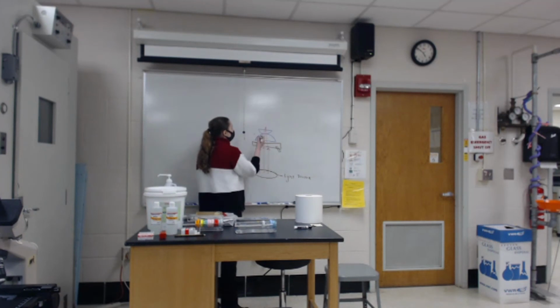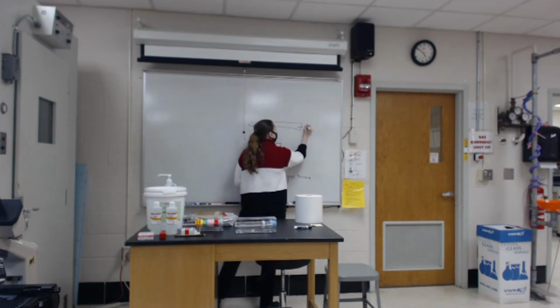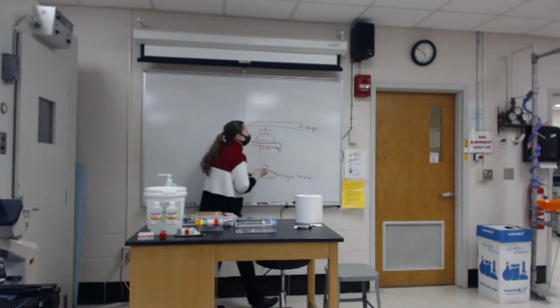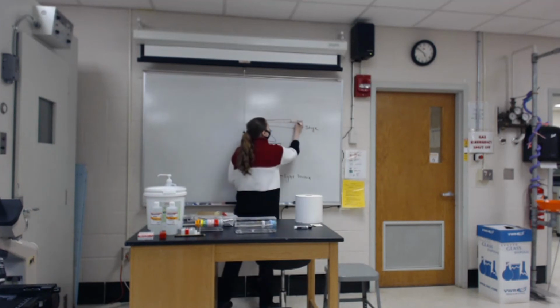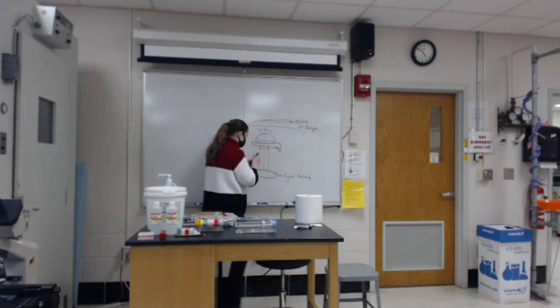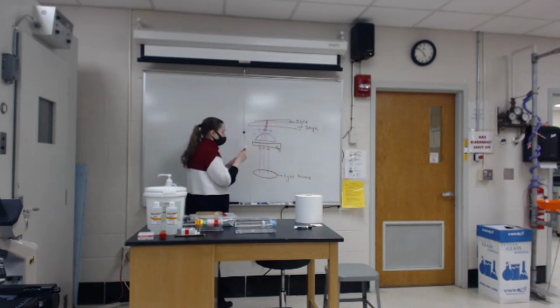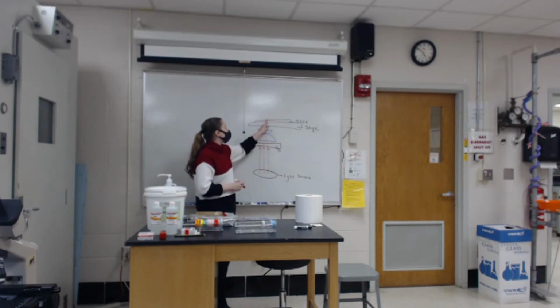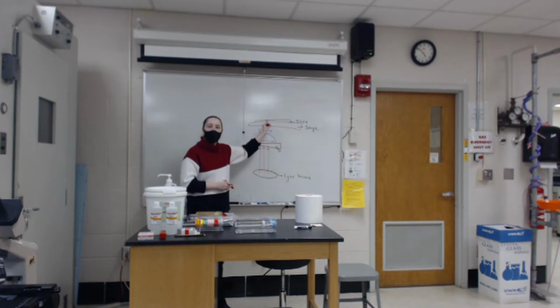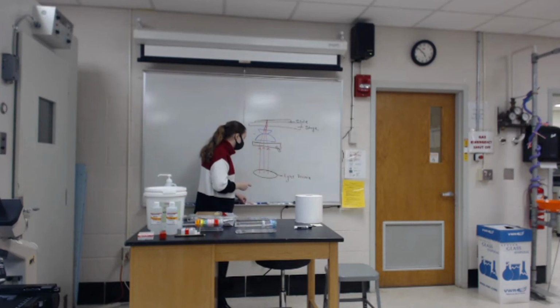Past the condenser, we're going to have the stage. This is a mechanical stage, and the stage is where we're going to rest our sample. This is where our slide will be. I'm going to adjust the light a little bit so it goes through our sample. You can see that the condenser is treating the sample and hitting the slide at a particular point, so all of that light is shining where we need it to go.